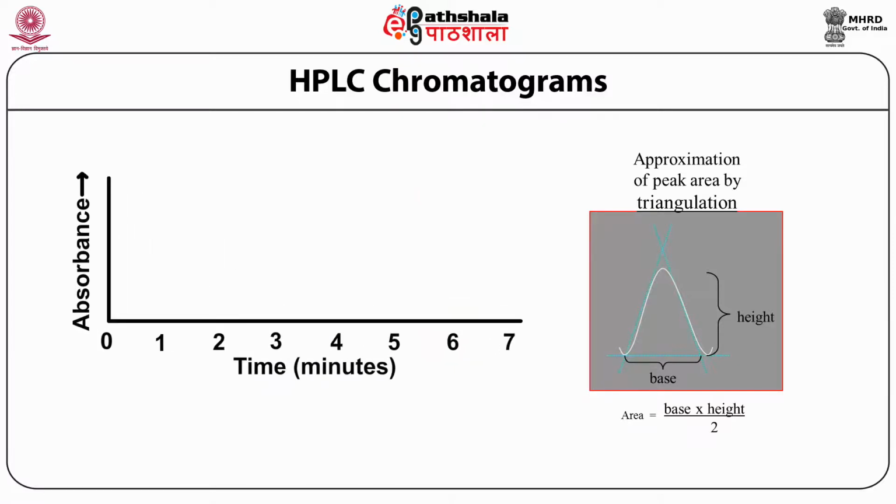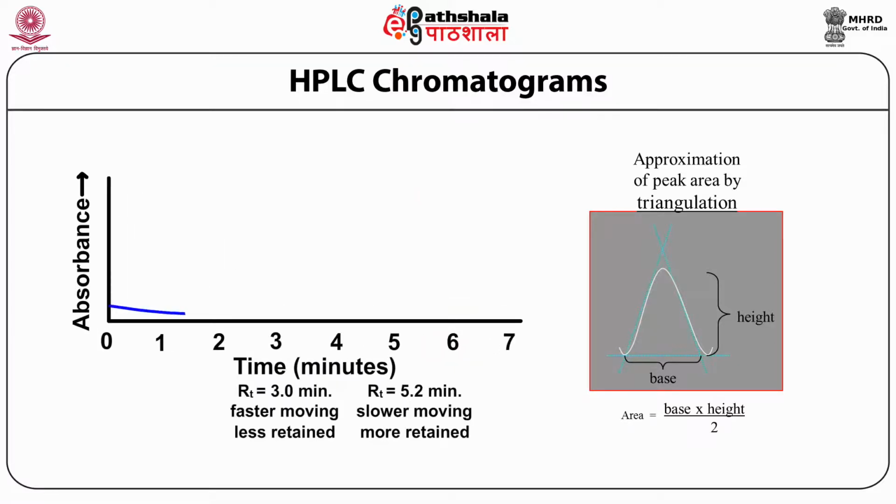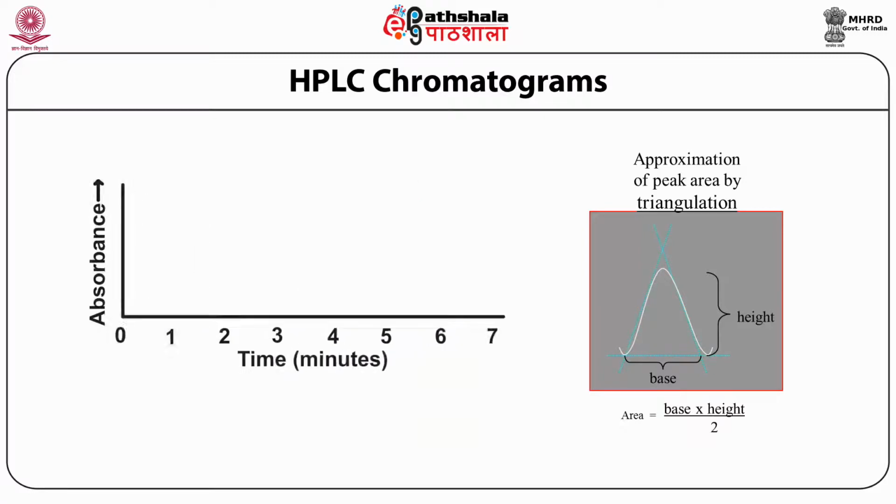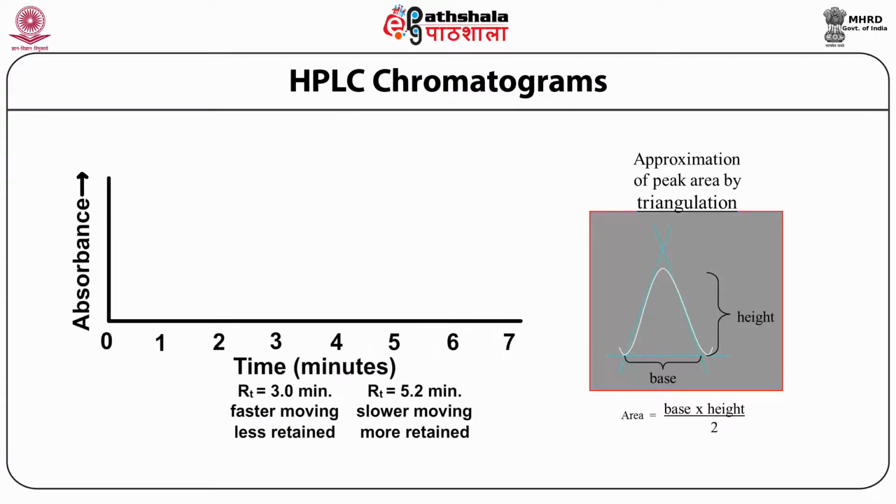Now, standards at various concentrations are injected into the HPLC in a graded series. The standard response, the peak height increase or peak area increase, is noted down. With that, a calibration curve is plotted, and using that calibration curve the unknown concentration is determined by a mathematical calculation.